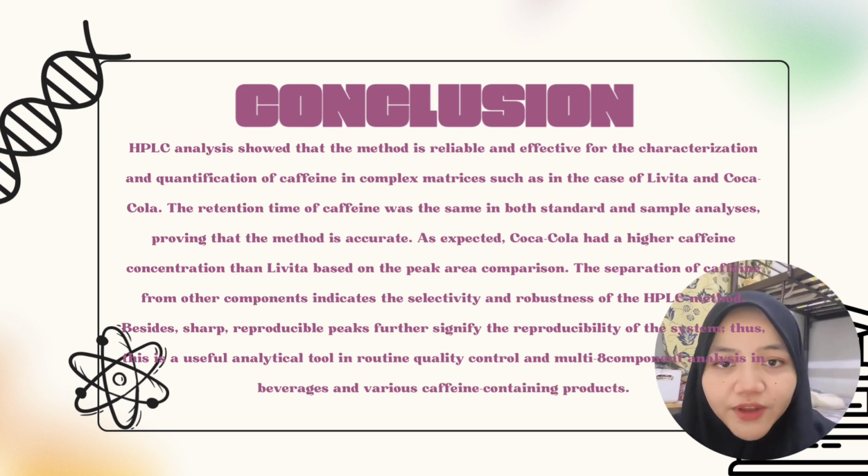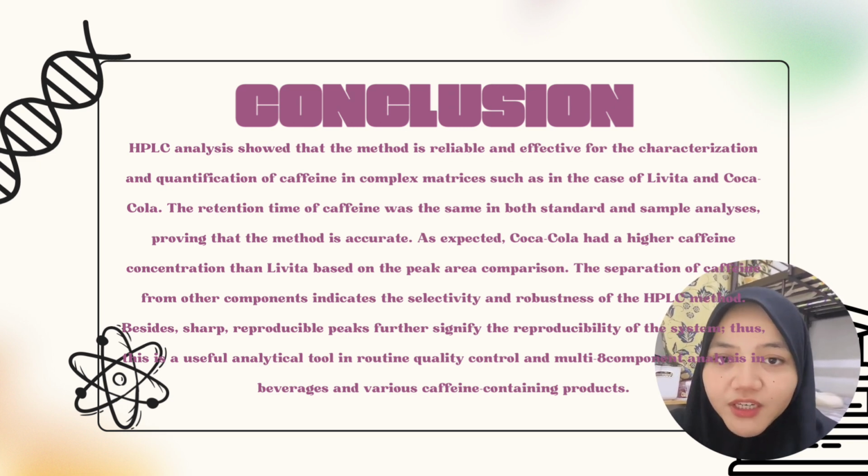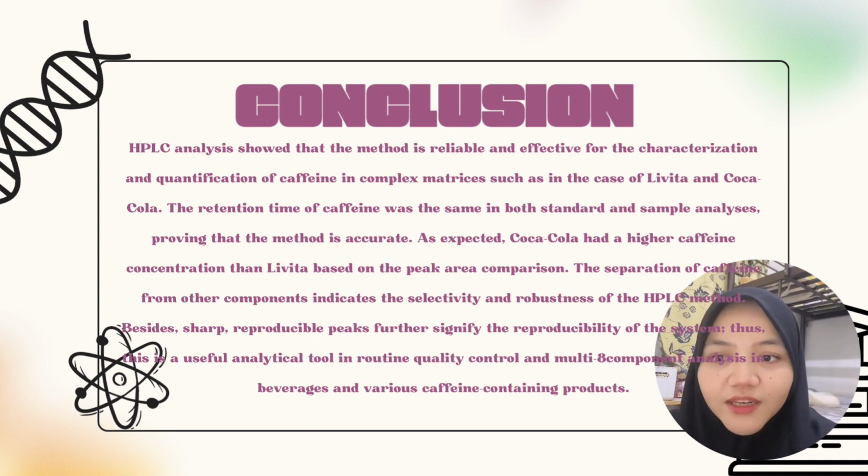The separation of caffeine from other components indicates the selectivity and robustness of the high-performance liquid chromatography method. Besides, sharp, reproducible peaks further signify the reproducibility of the system. Thus, this is a useful analytical tool in routine quality control and multi-component analysis in beverages and various caffeine-containing products.